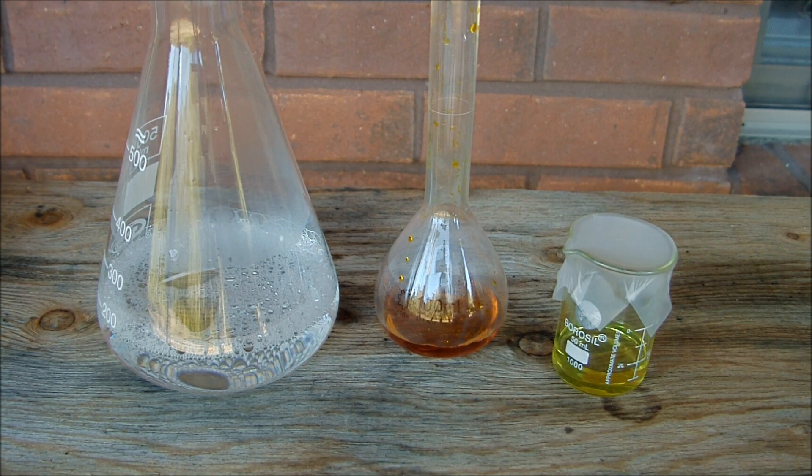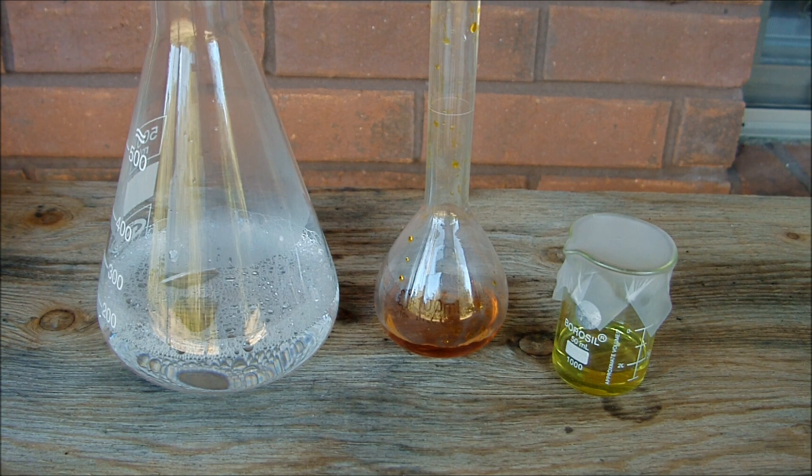Hey, everyone. In this video, I'm going to be making ferrofluid, which is a liquid that responds to magnetic fields. To do this, I'm going to use the iron 2 chloride and iron 3 chloride that I produced in a previous video.